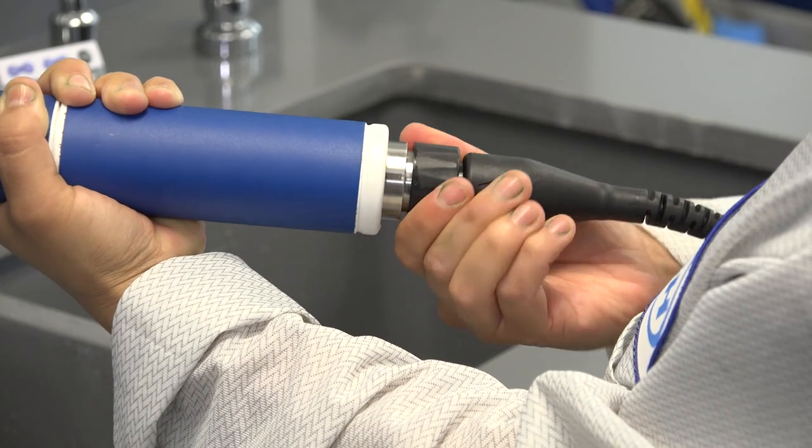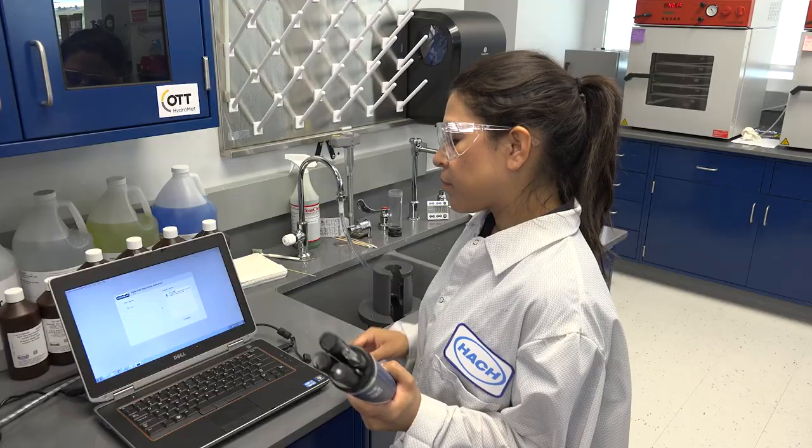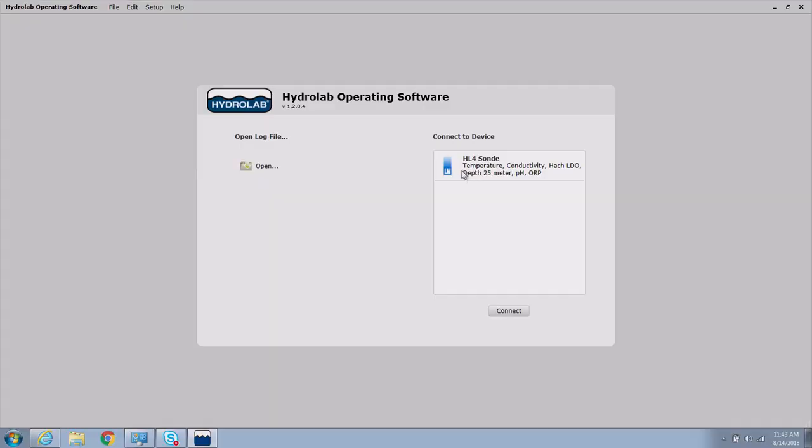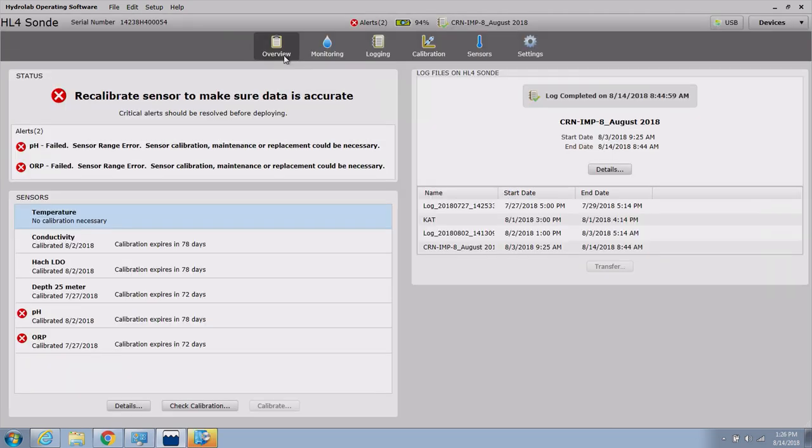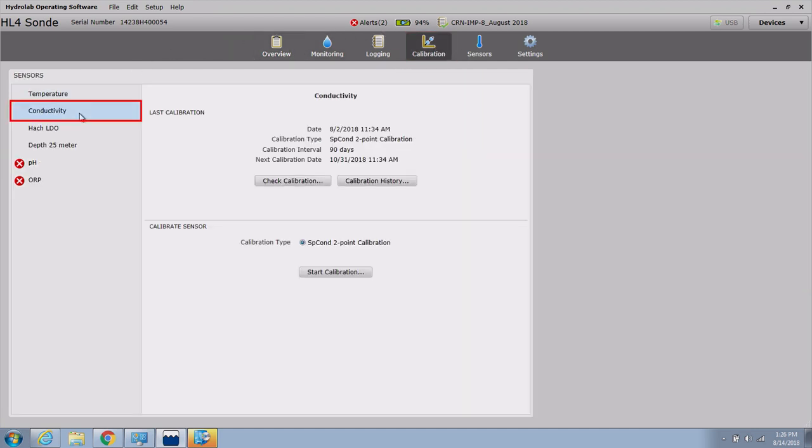Establish a connection to the sonde with the HydroLab operating software. Select your HL series sonde from the Connect to Device list and click the Connect button to connect to the sonde. When the sonde finishes its initialization, click the Calibration button in the navigation bar, then click Conductivity in the sensors list on the left-hand side.